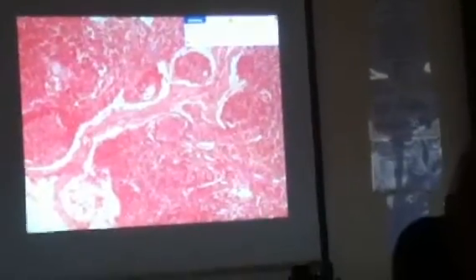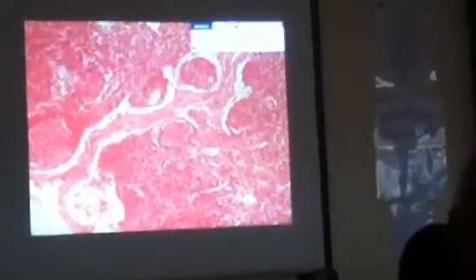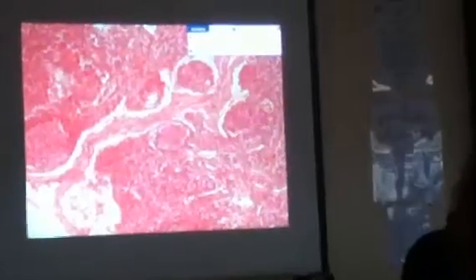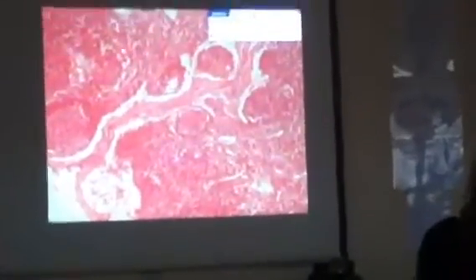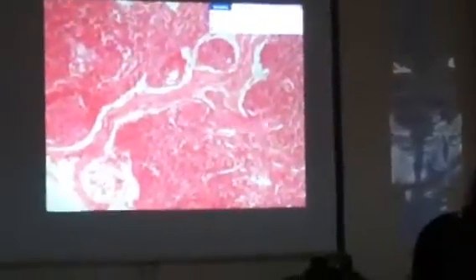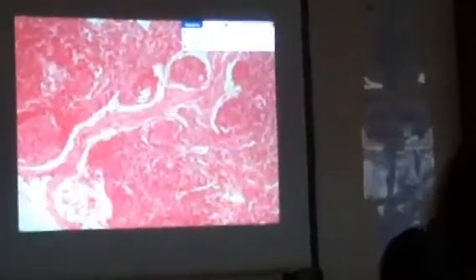Okay? Mayroong mga blood vessels entering the tissue. All the tissues of the lymph node. That should be the hilum, that entire thing. Okay? Hilum, and then the cortex, which is showing us lymphoid.